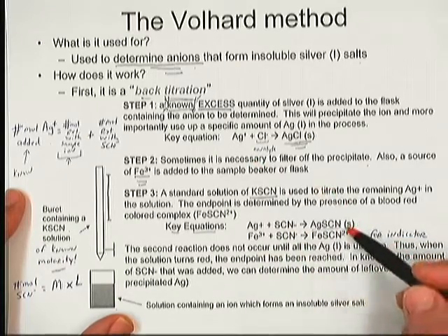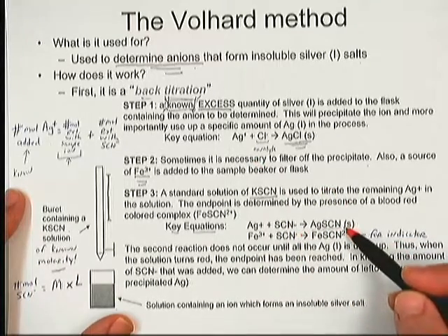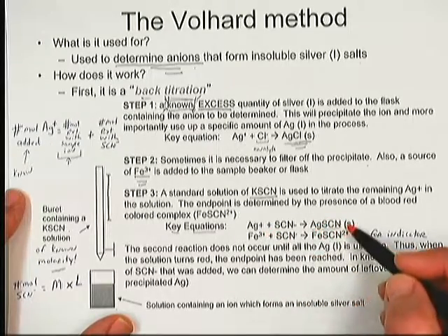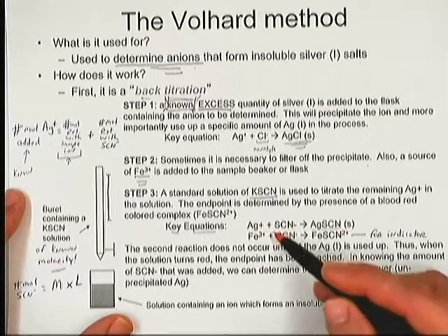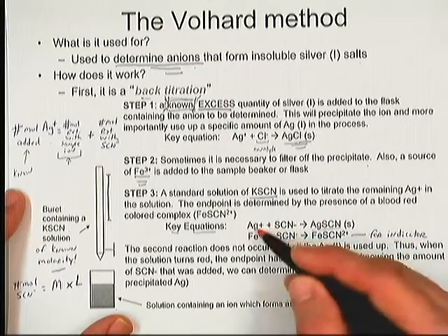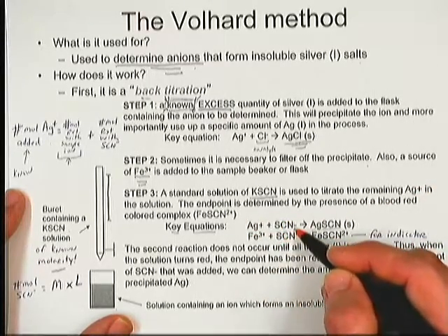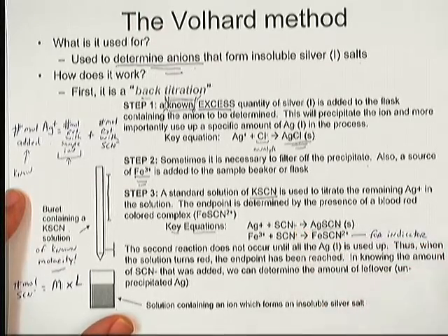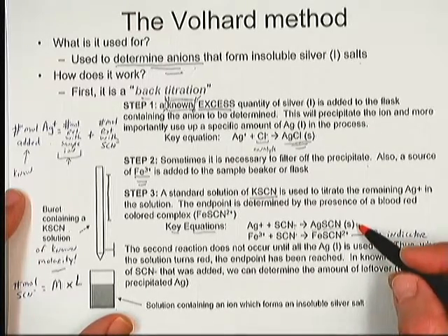So what do we do? We titrate with this ion to form this solid. And when this stops forming, we've reached our equivalence point or our end point, and we could backtrack out how much silver must have been present in excess if we know the molarity of this stuff and we know the volume of this that we titrated. So that's going to be our measurement strategy here. The only problem is that we don't have a good indicator yet.